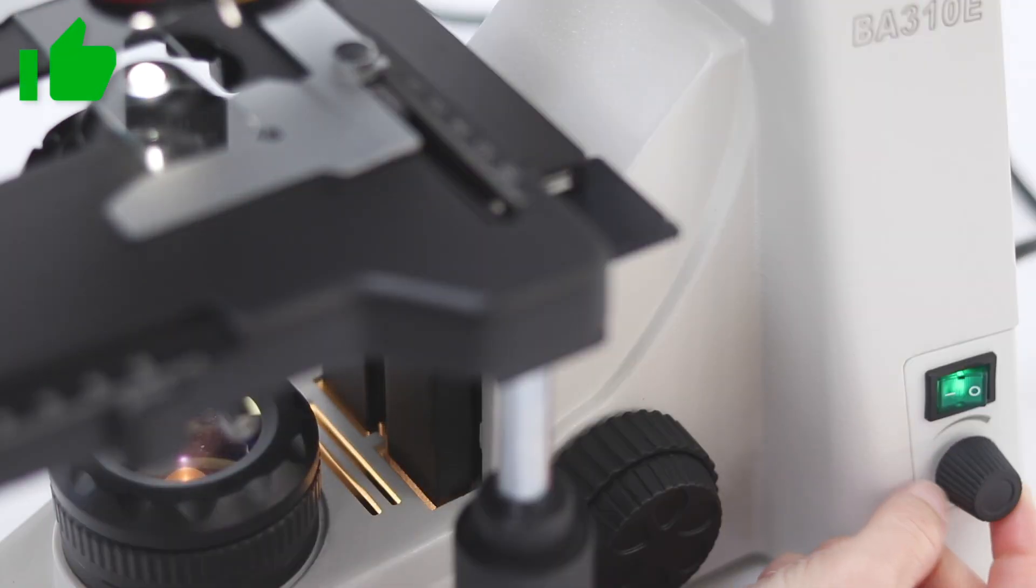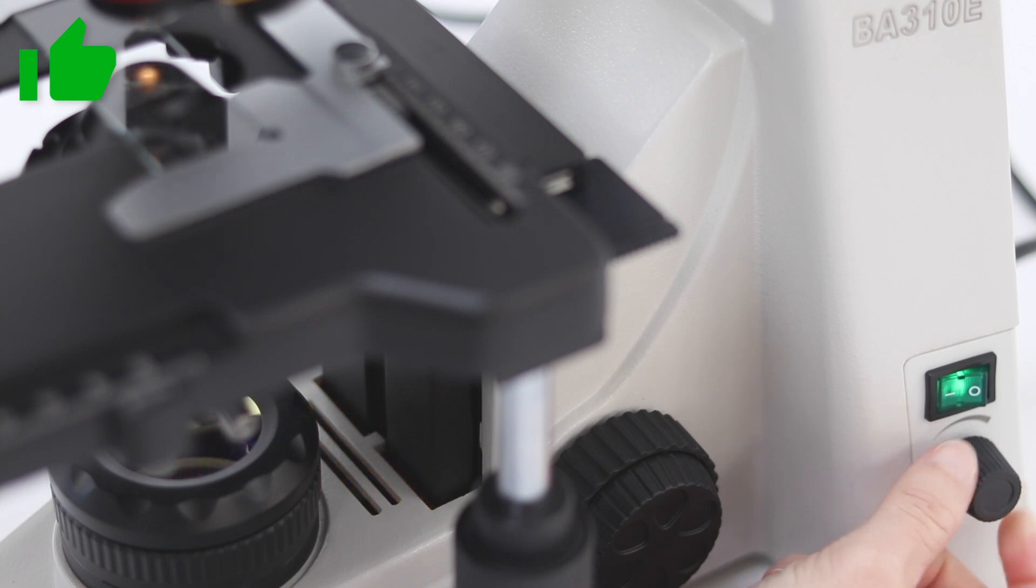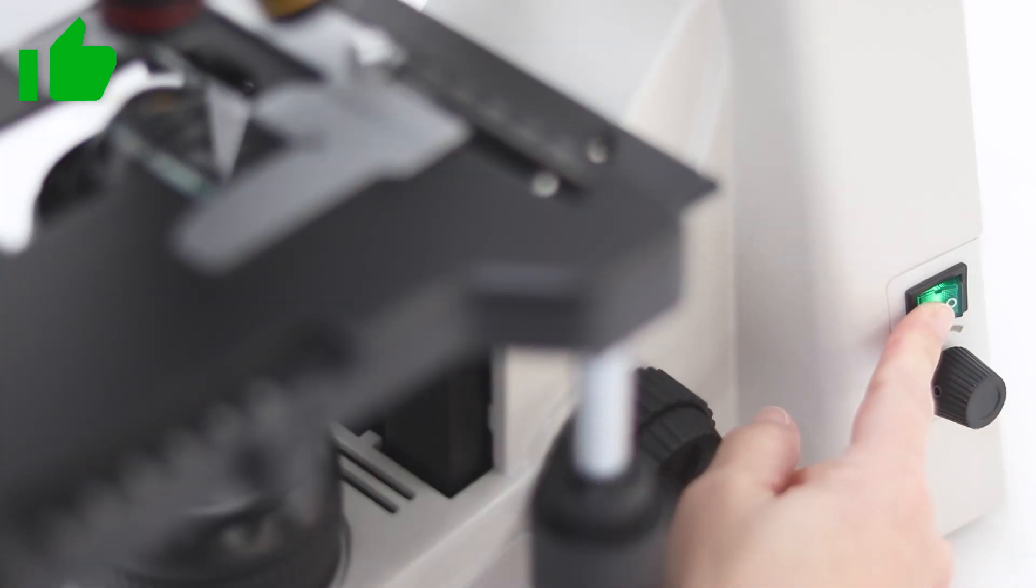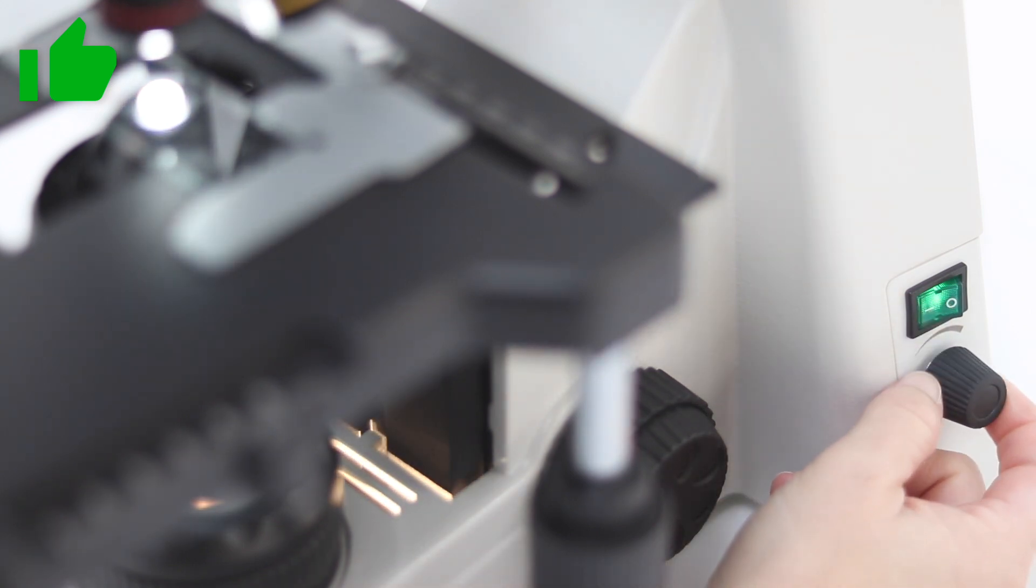After using the microscope, reduce the light intensity control to the minimum before switching it off. This way, you will extend the life of the bulb as when the light is switched back on, it won't suffer any power surge.